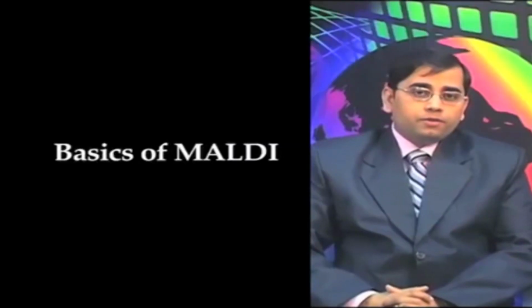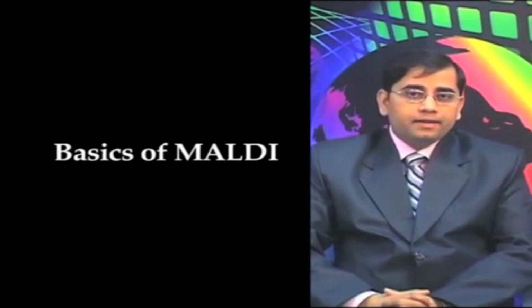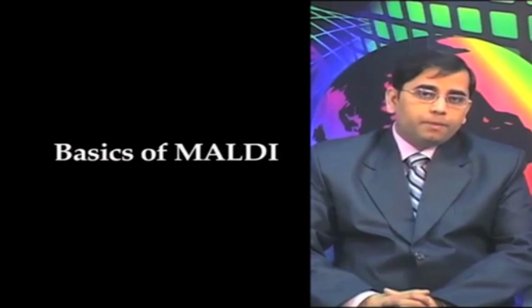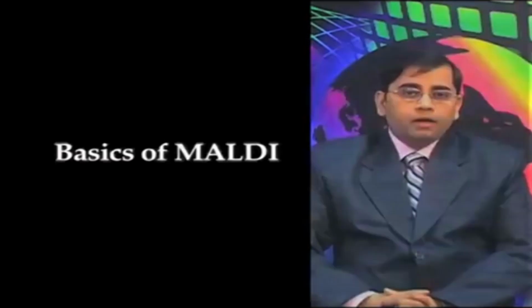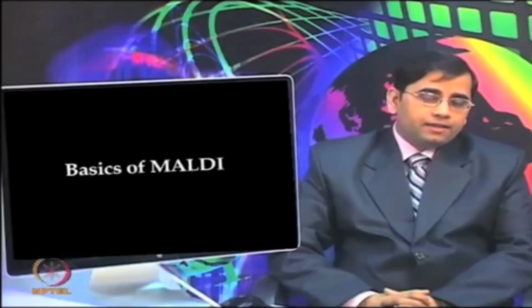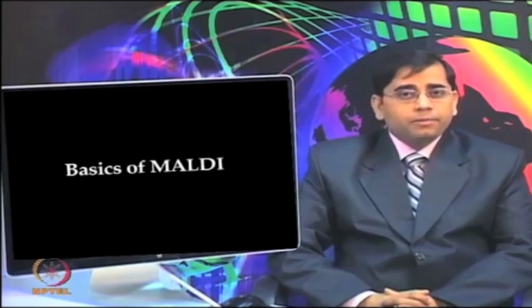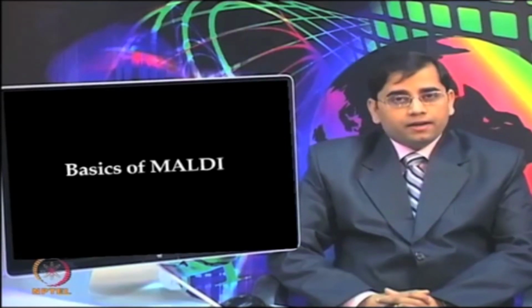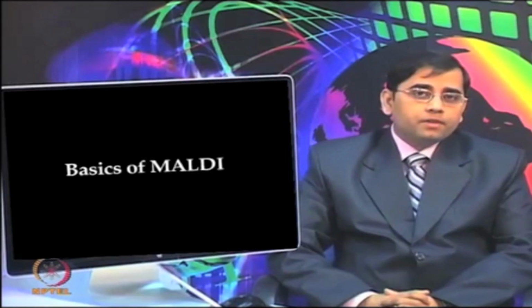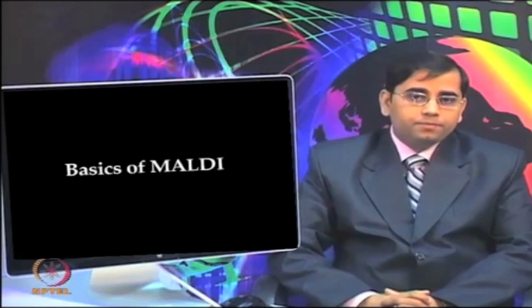Let us first start with the basics of MALDI. MALDI is an efficient process for generating gas phase ions of peptides and proteins for mass spectrometric detection. MALDI is one of the most widely used ionization techniques currently applicable in the proteomics area. This ionization method was independently developed by two scientists, Koichi Tanaka and Hillenkamp. Tanaka also received the Nobel Prize for his novel contribution to soft ionization techniques such as MALDI.